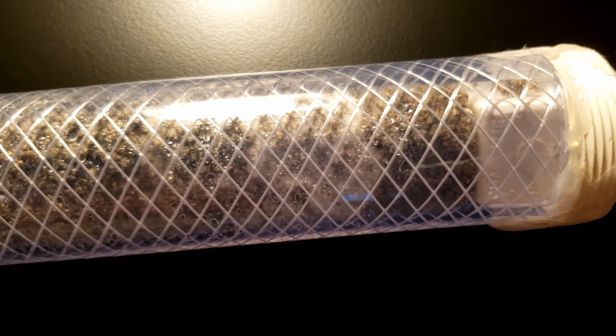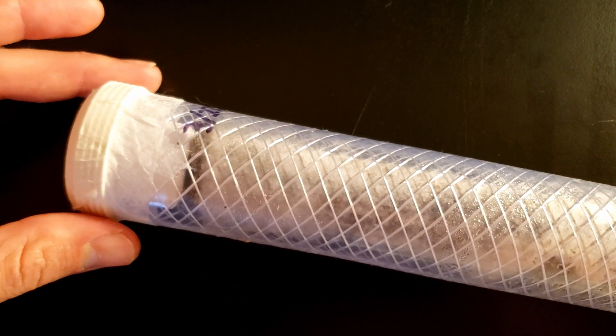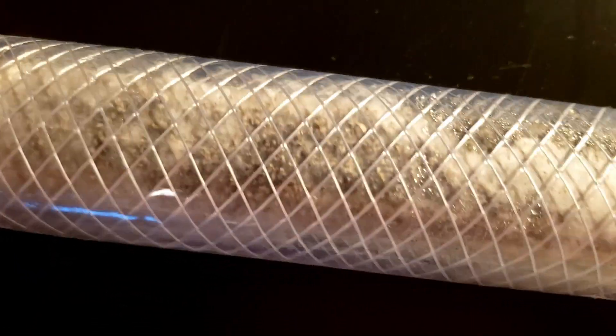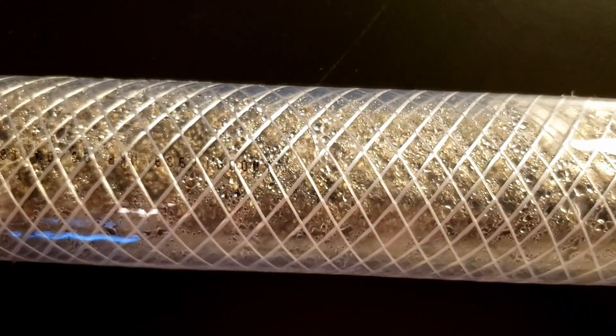It's been 13 days since I inoculated this tube. I inoculated the tube on both ends. This is going to be the bottom, and you can see the growth is really, really good looking. As we move along, we see some patches of mycelia in the middle. On the other end where I also inoculated, there's some mycelia, but a lot less than the other end.